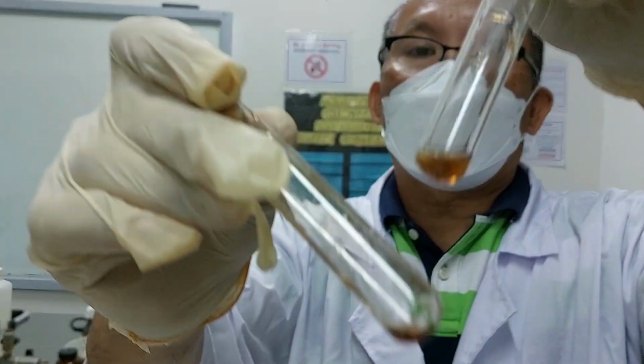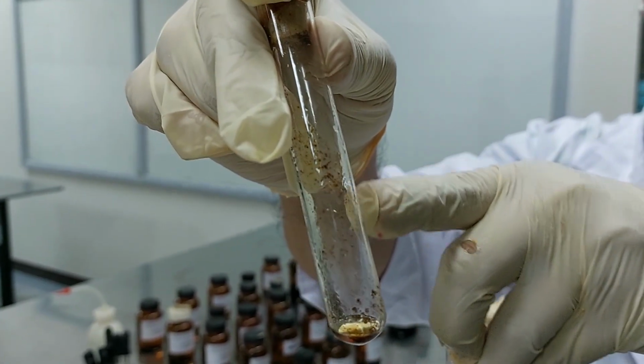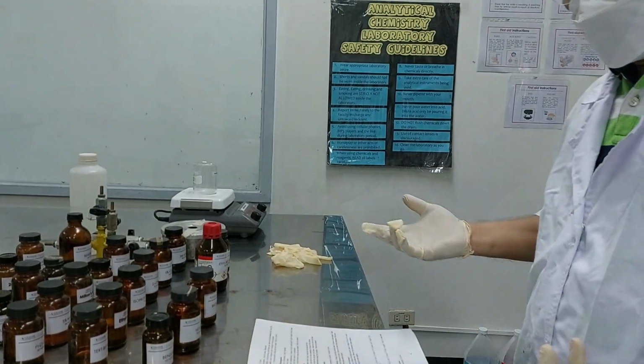See that? No? So you see that precipitate? You see that brown precipitate? That is MnO2. Okay?